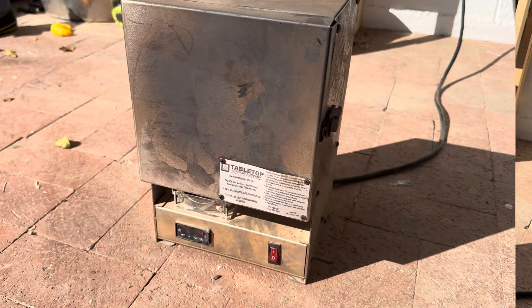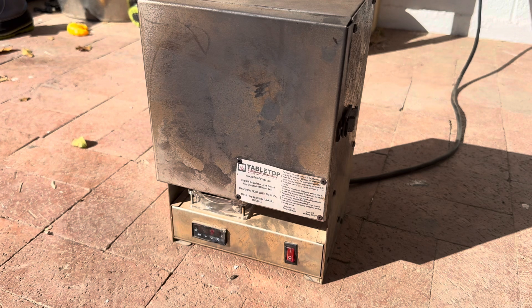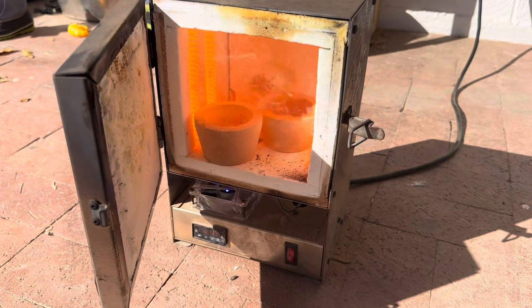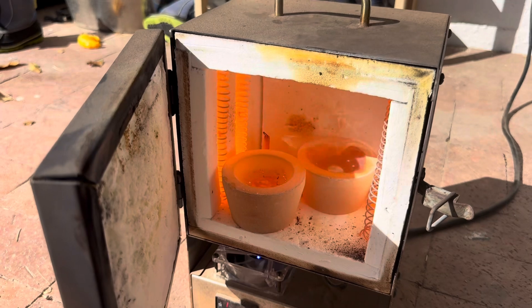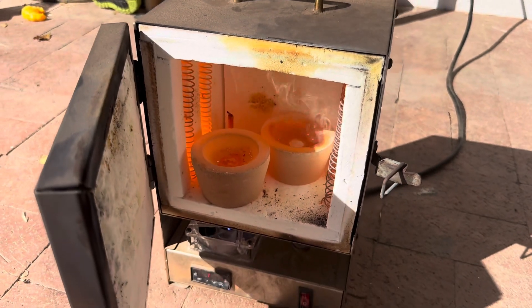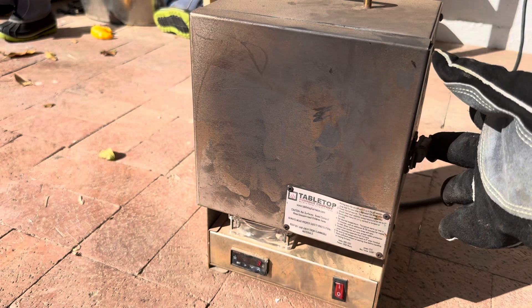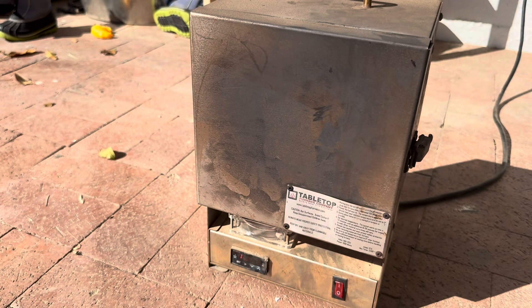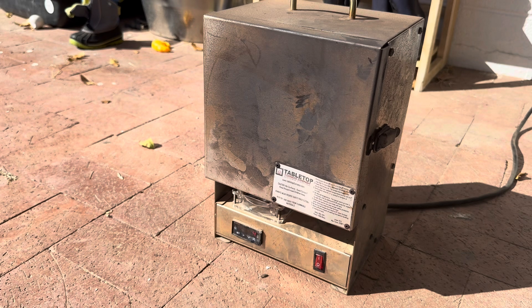We're starting to get there — not quite hot enough yet, so we'll let it keep doing its thing. All right, we should be up to a good temperature — 2100 degrees. We should see both cupels with liquid metal in them. Oh yeah! Certain oxides up on the top. The collector metal looks really good — looks like it's about done. We'll let it go for a little bit longer, then pull them both out. I'm going to pull the one with the collector metal out and check how the non-collector metal one is looking.